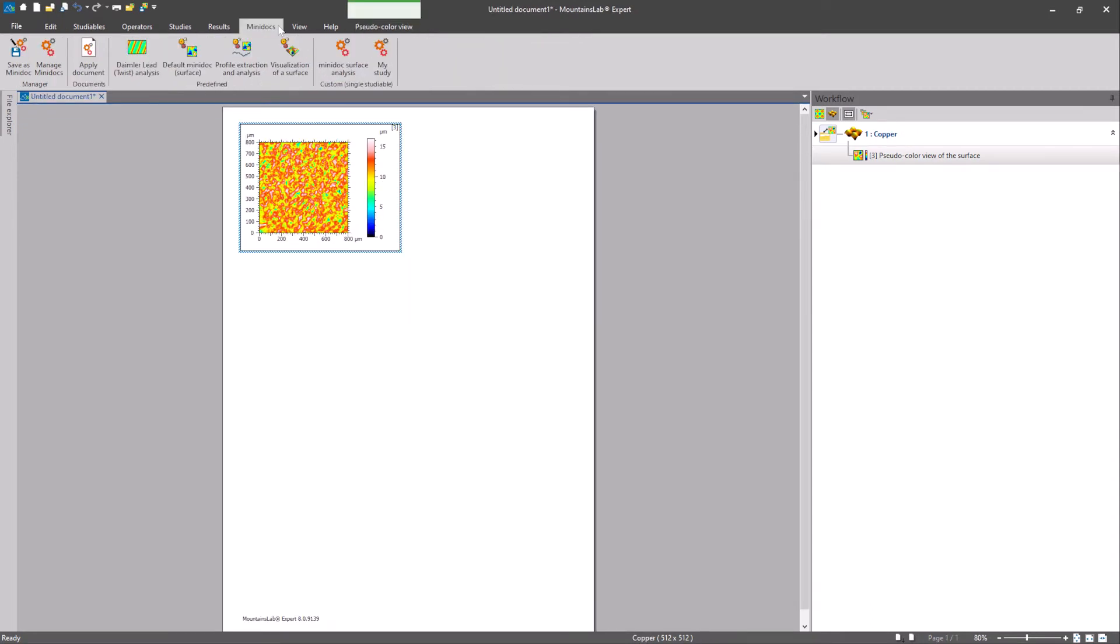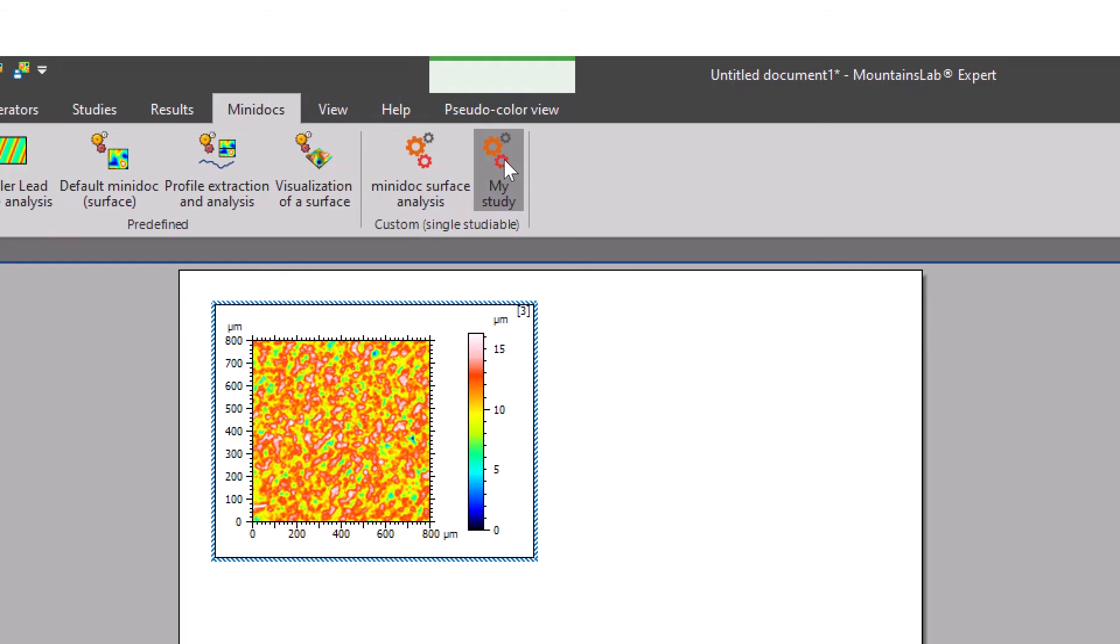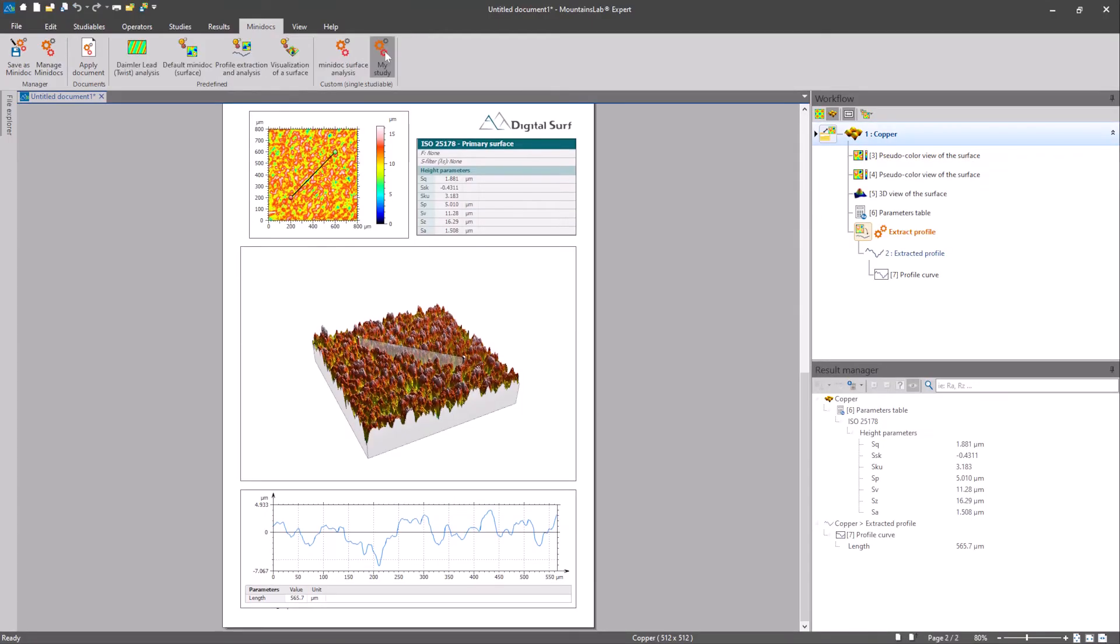To apply these steps to other data sets, all you need to do now is click on the icon you created in the mini-docs tab. It really is that simple.